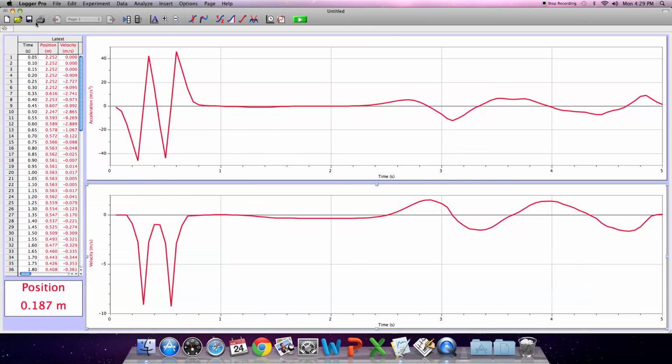If we want to print our data, which we're not doing for the lab, you can do this here. If we're ever doing a lab over multiple days, we might want to create a file for you to come back to. There's other things you are free to mess around with on your own, but those are the basics.